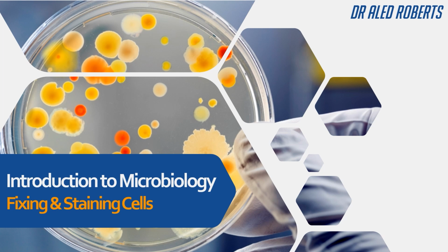Hello and welcome to this introduction to microbiology video. I'm Dr. Aled Roberts, and in this video we're going to look at the ways in which we can fix and stain cells for light microscopy. And a key question is, why might we want to fix and stain cells?